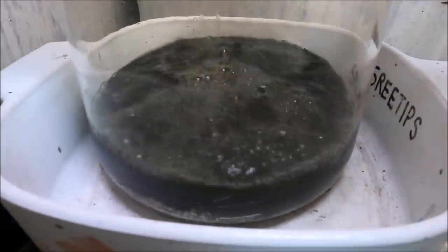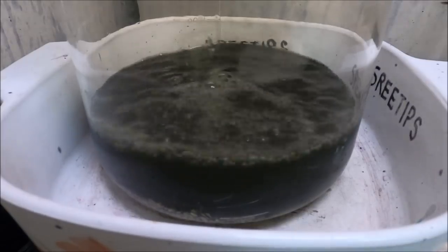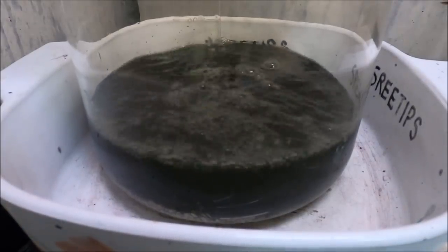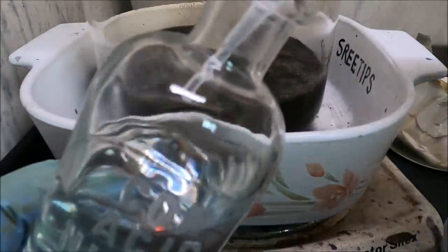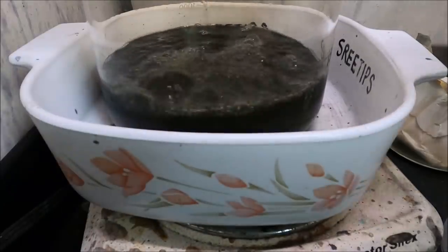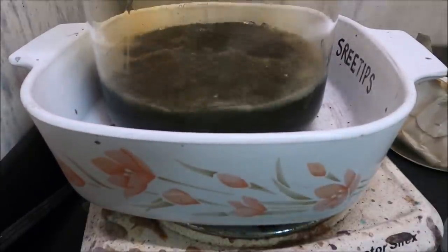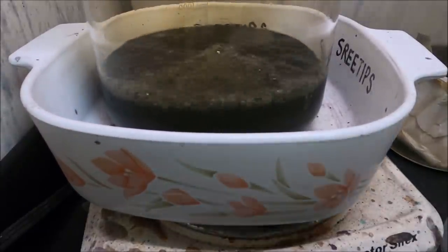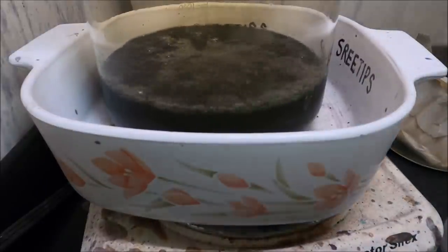Pellets still down here in the bottom of the beaker. What I'm gonna do is I've got concentrated nitric acid here, and I'm gonna reach in here and grab a few milliliters with a pipette, add it to our boiling liquid in this beaker. Here we go. And I'm just gonna keep doing this until I get everything to go into solution in this beaker.